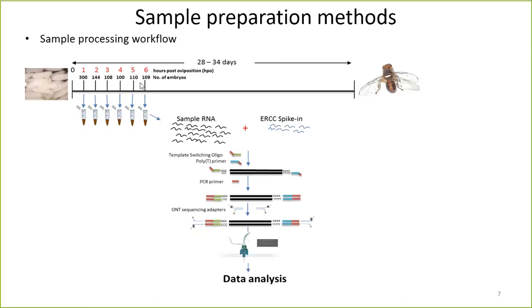And at the time of cDNA synthesis, we will add internal RNA standards, the ERCC spike-ins, commensurate to the number of embryos that we used per time point, so that we know how much ERCC standard we add per embryo. And then we use our own protocol, a customized published protocol, to perform Smart-seq full-length cDNA synthesis.